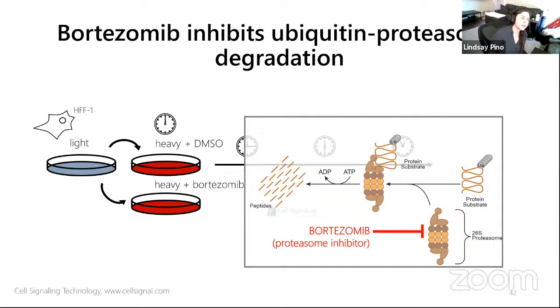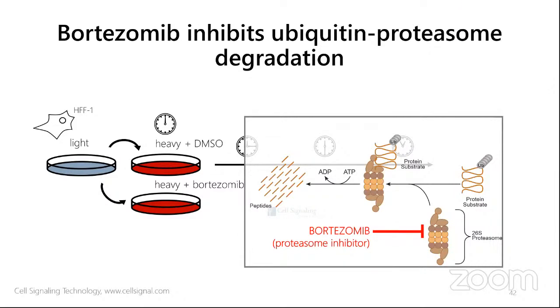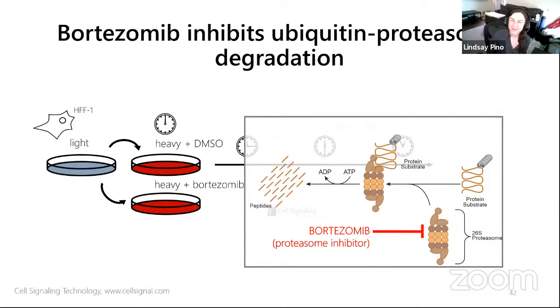I have not seen a paper comparing that with pulse SILAC, but Professor Vitek, Olga, actually has a good paper with, I think, Lucas Reiter, that compares DIA with DDA. Maybe someone can drop a paper for that. I don't know it off the top of my head. I will add the reference in the Google Doc. Perfect. That's an excellent paper.